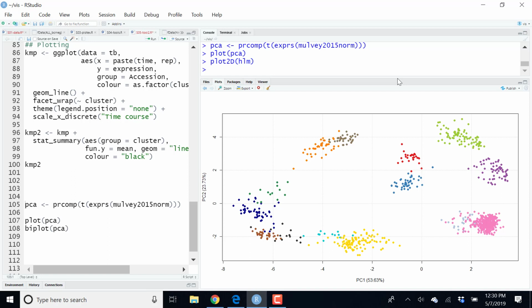And so, because these are completely different scientific questions, here I want to do what we did before with the hierarchical clustering and see to what extent the structure of my data corresponds to my experimental design. So I want to do a grouping, clustering PCA of my samples.